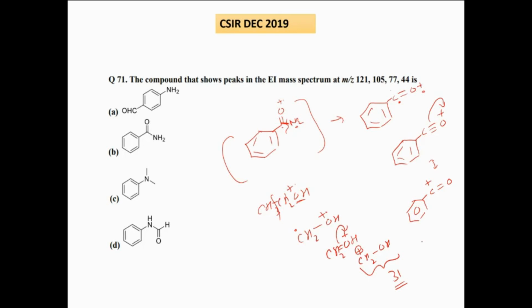அதே இது amine இருக்குன்னா, so after stabilization, amine இருந்துச்சுன்னா இந்த மாதிரி ஃபார்ம் ஆயிருக்கும். NH2 plus dot. So this will be having a weight of 12 plus 14, 26 plus 4, 30. Amine இருந்துச்சுன்னா 30ல base peak கிடைக்கும். So you'll have a base peak at 30 for amines, primary amines. Base peak for alcohol will be at 31.